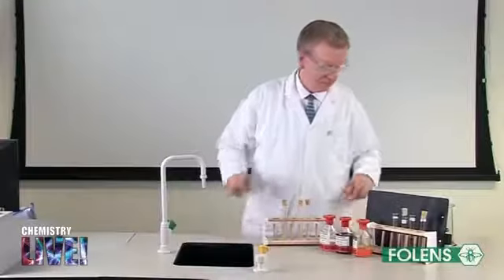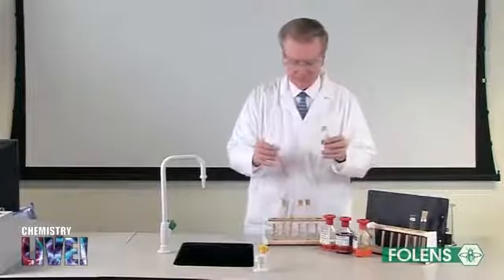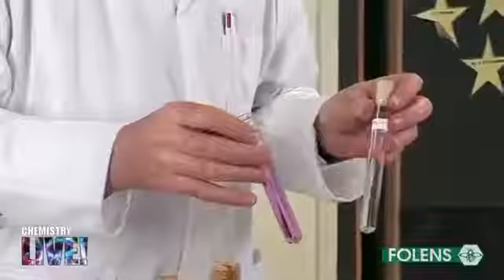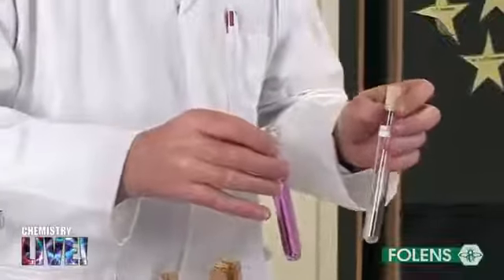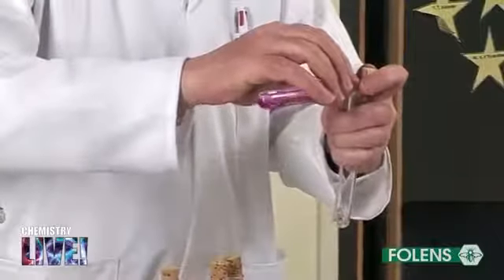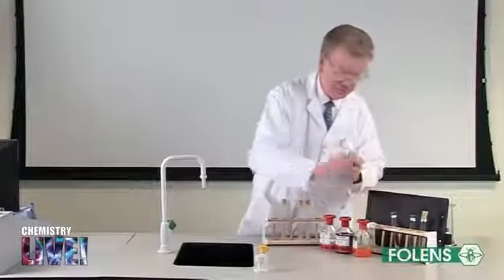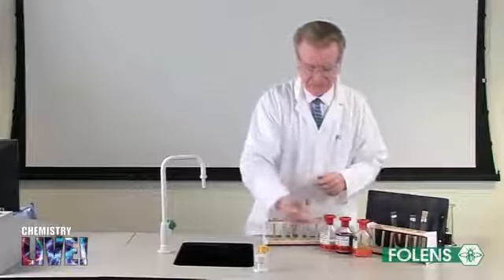Addition of acidified KMnO4. As in the case of the preparation of ethene, potassium permanganate can be used to test for unsaturation. Add about 1/10 of a test tube of potassium permanganate to a test tube of ethine. Replace the stopper and shake the test tube a few times.